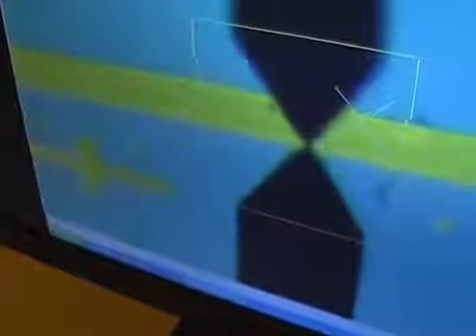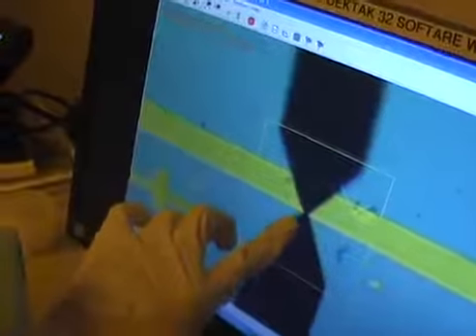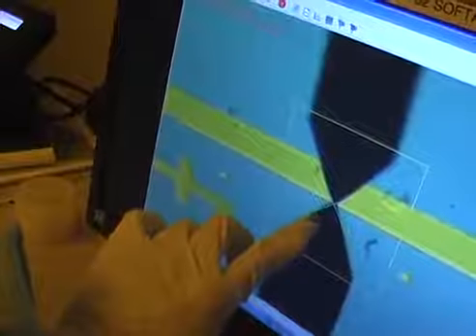You could move in the X direction and move in the Y direction, just to make sure that the tip is in the center of the box. And you could also change the focus to see the tip. And then we use the mouse. There's a cross on the mouse. We use the cross center to be overlapped with the tip, and double click it. Then the calibration is finished. We can now start the measurement.